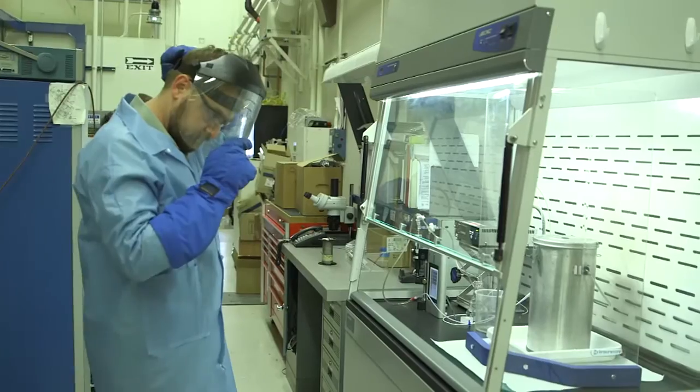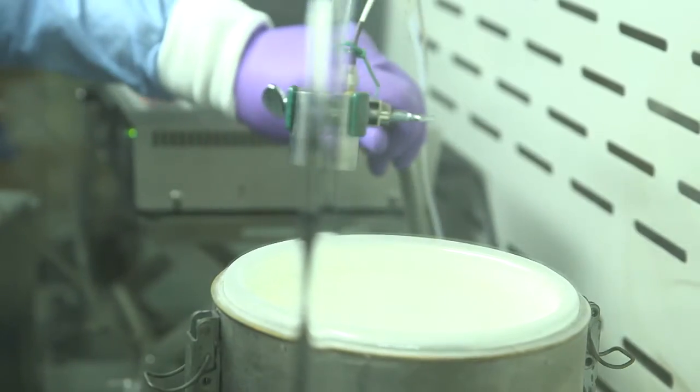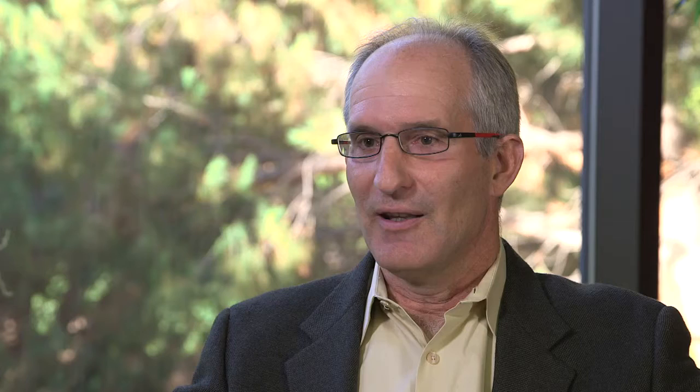The Nanoscale Synthesis and Characterization Laboratory reaches out across the world to collaborate with leading scientists. In addition, we also collaborate with scientists at the light sources, at the APS and the ALS, to deal with advanced characterization.